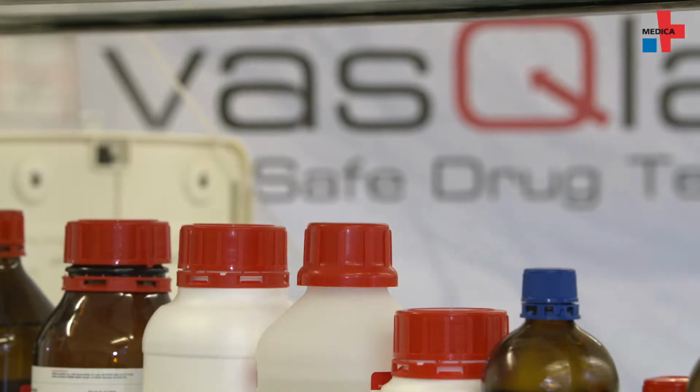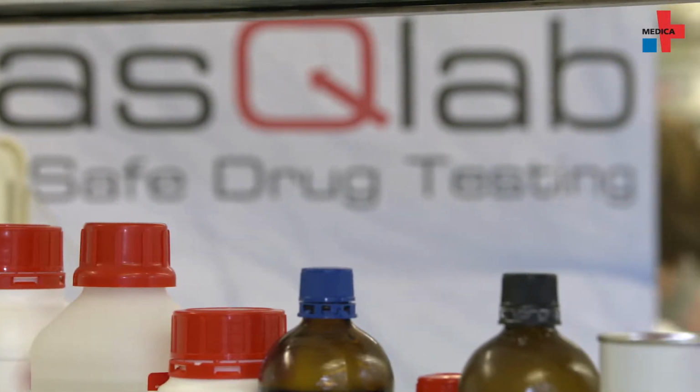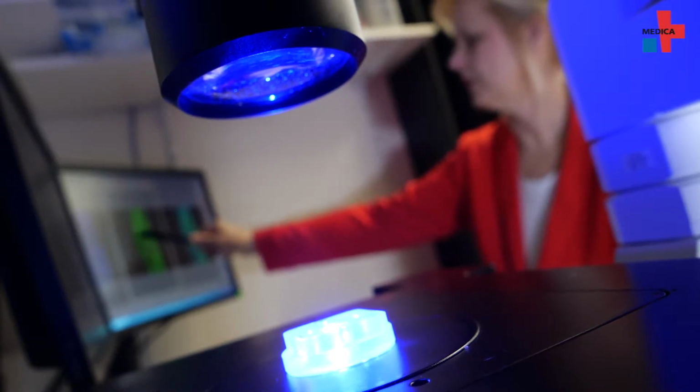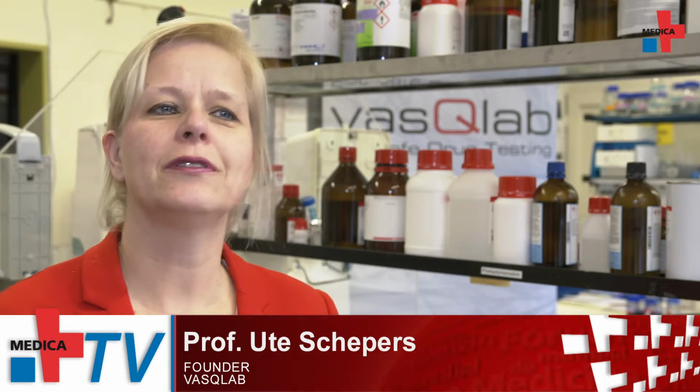We are guests at the vasQlab at the Karlsruhe Institute of Technology. Professor Ute Schepers explains the process of testing active pharmaceutical ingredients using human tissue without putting humans in danger. Tissue engineering refers to the reconstruction and emulation of healthy or diseased tissue, which is something you typically only find in nature. These days, we can reproduce and imitate this process with various methods.